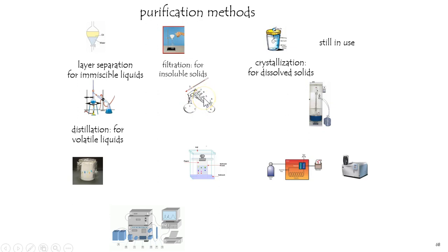Position 5 here goes right to the interior tube, so you can apply a vacuum, which is basically pulling gases out as they form. Don't forget it condensed already, so we should be okay, and you won't lose your stuff. And then it goes into position, what is that? 8, which is simply your receiving flask. That is distillation. If you really got a tough separation, say 1 degree difference in boiling point, use this thing.